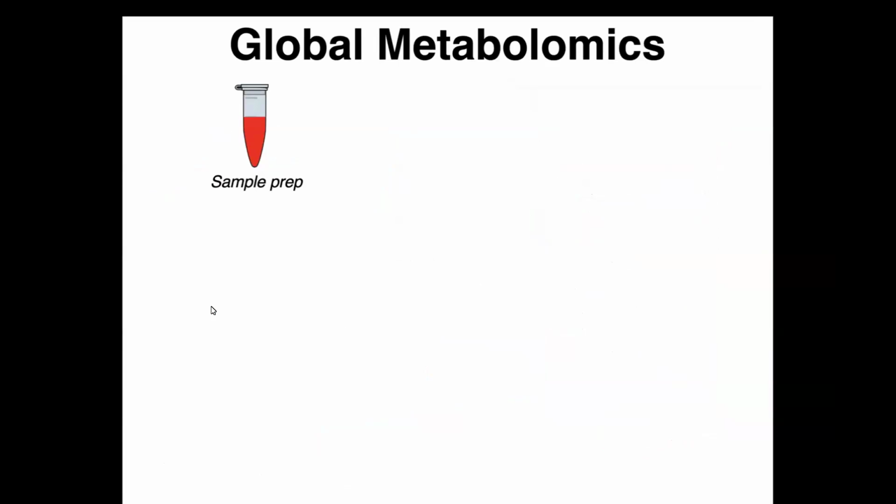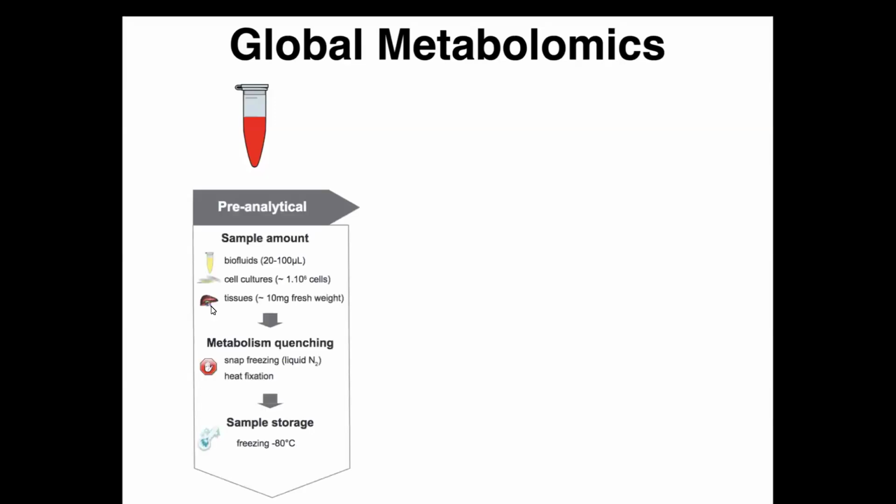The first step of the workflow is sample preparation. Samples must contain 20 to 100 microliters of fluid, 10 milligrams of tissue, and at least 1 million cells.